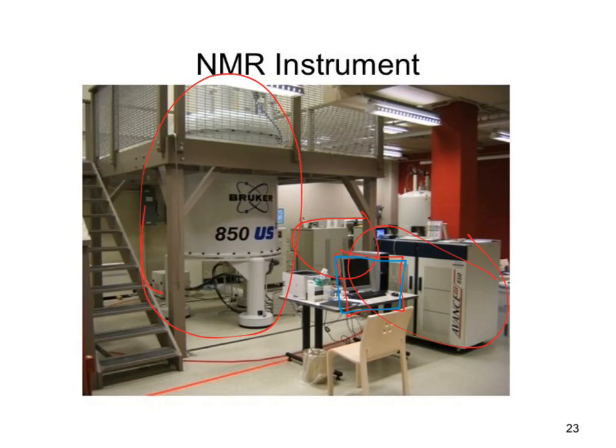So this happens to be one of the larger instruments. The smaller ones, there's another image of one in the background, usually the 300 or 400 megahertz. I think the 400 or 500 is probably about 7 feet tall, and you have to climb up a ladder and drop your little sample in. And your sample is just a tiny little tube.